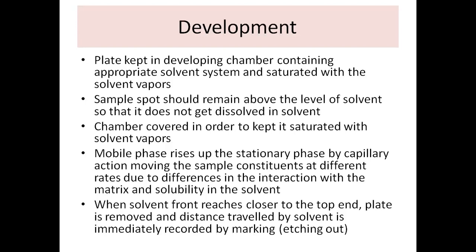The different components, because they have different partitioning in the stationary and mobile phase, will be carried over the stationary phase to a different extent. And that is the reason why the different sample components will get separated from each other. Is that right?